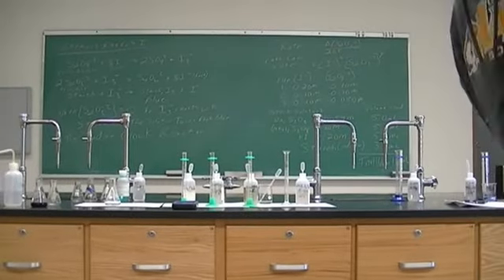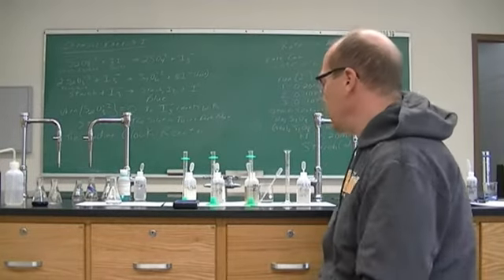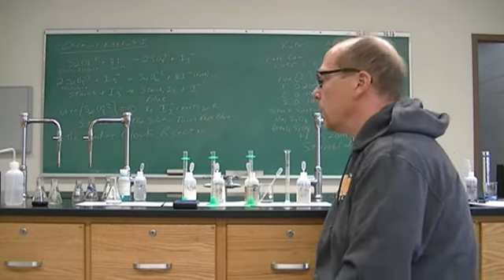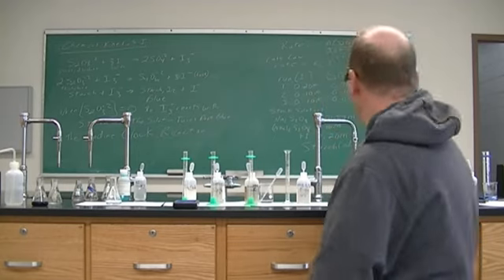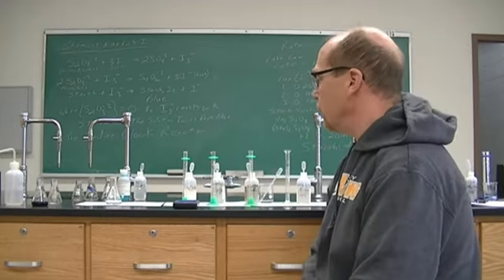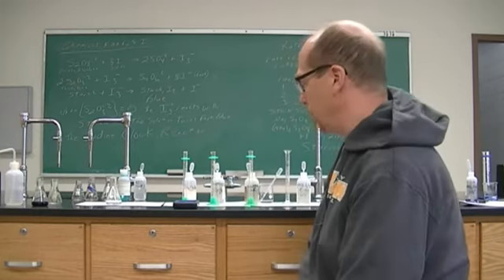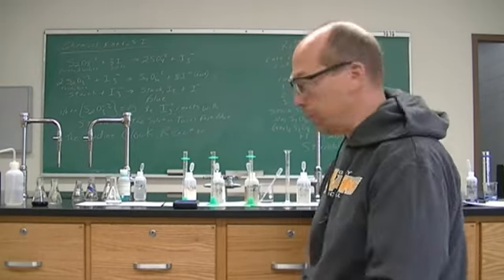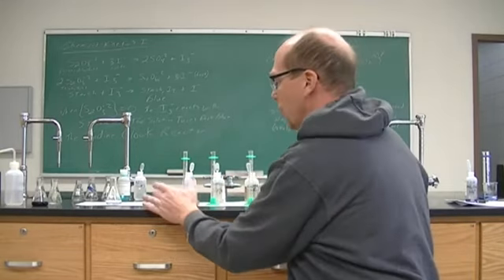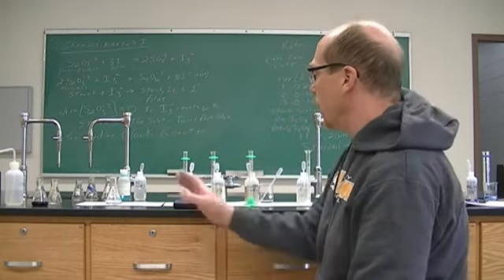All right, we had a bit of a camera problem there. Right now we are doing run 2 with the 0.1 molar KI. So run 1 took 1 minute and 46 seconds. All right, run 2, I will tell you the time since we had some camera problems. While this is going, we're at 1 minute and 13 seconds right now. We're going to let that go.